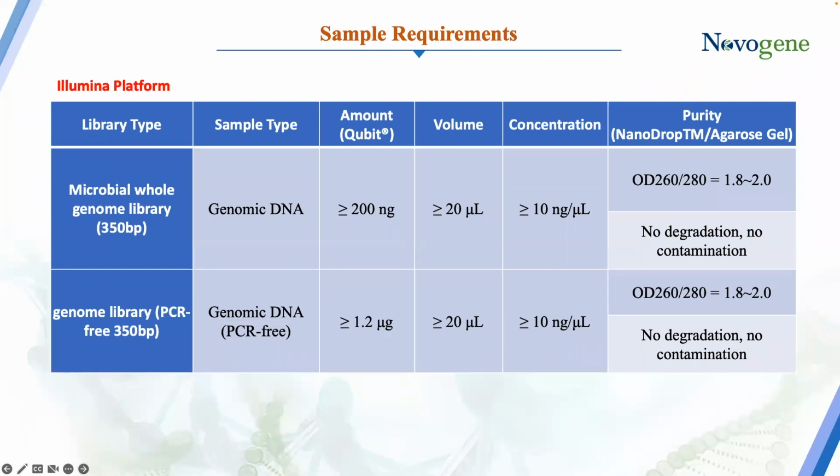On the flip side, we can also prep a library without PCR, but as I mentioned, we need enough material to run on our lane. And so you need to have the starting material just already there. So you'll need at least 1.2 micrograms to start before the adapters are added. And these are the two different approaches that you can take to library prep. So this will hopefully give you an idea of, if you're considering one of these projects, do I have enough material to even get started? And can I even consider doing the PCR-free library prep? Or do I need to go the more traditional route of using the PCR-amplified library?